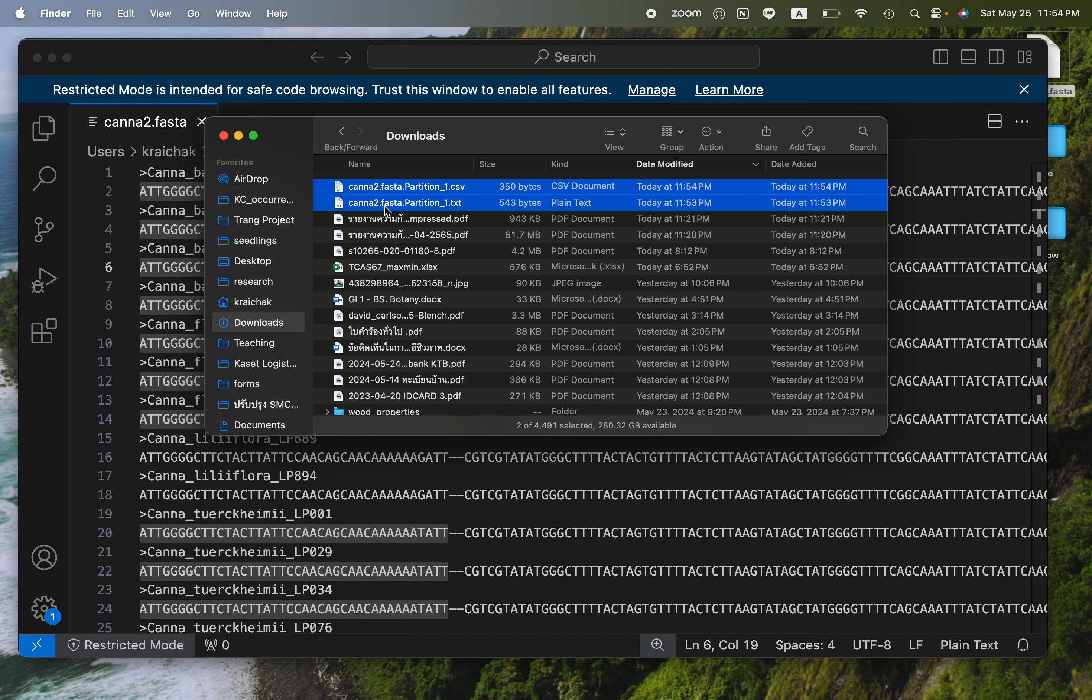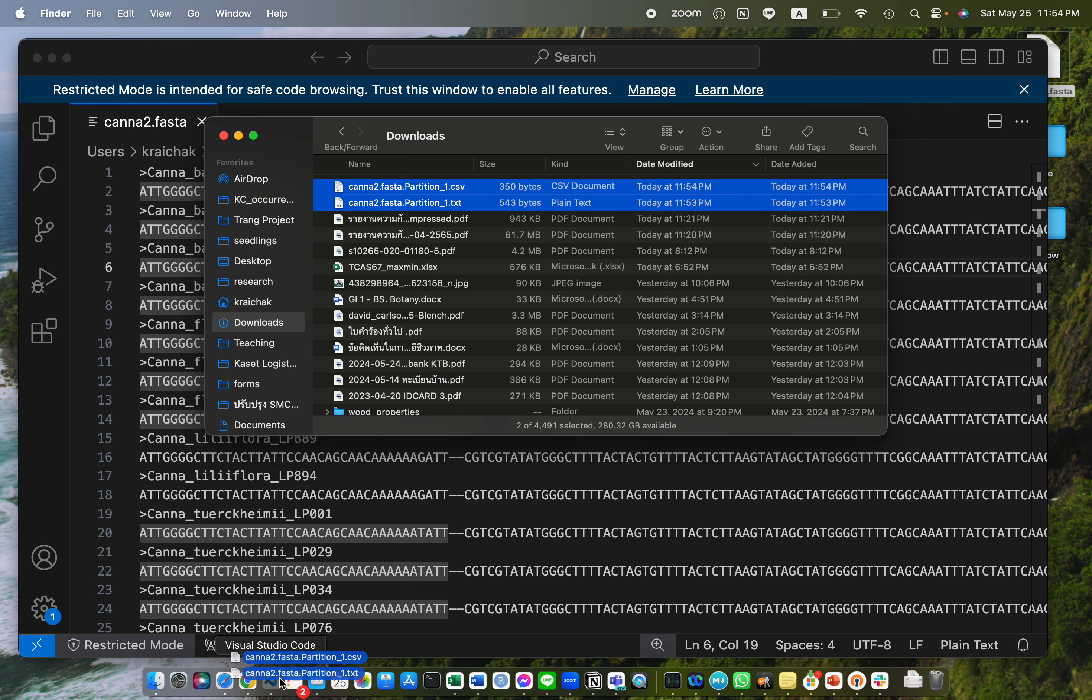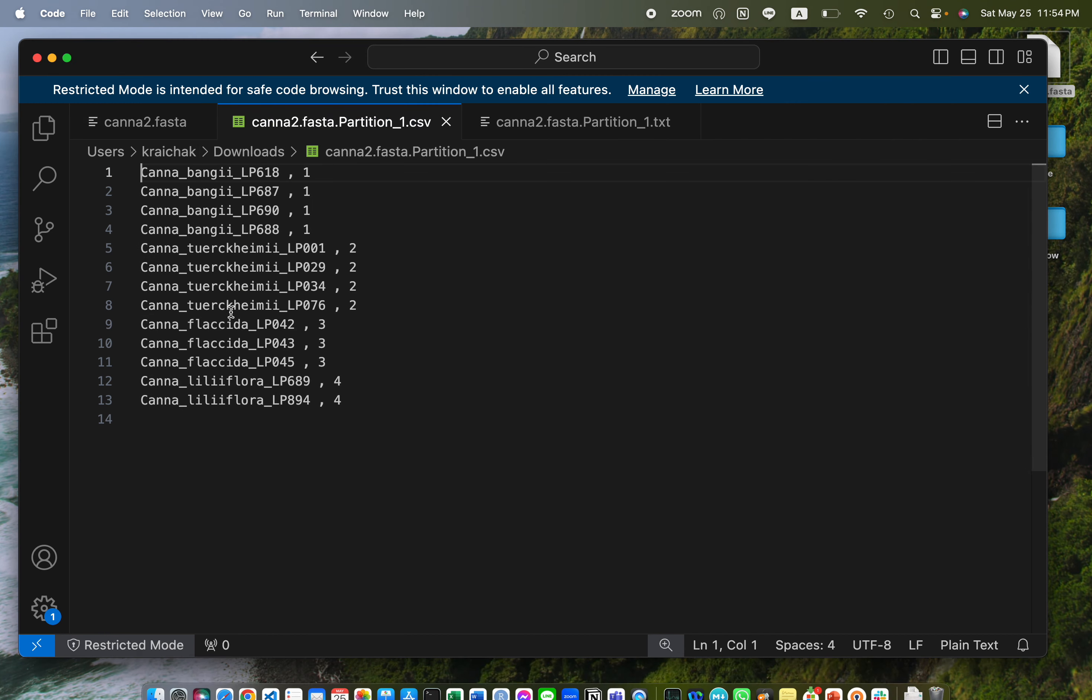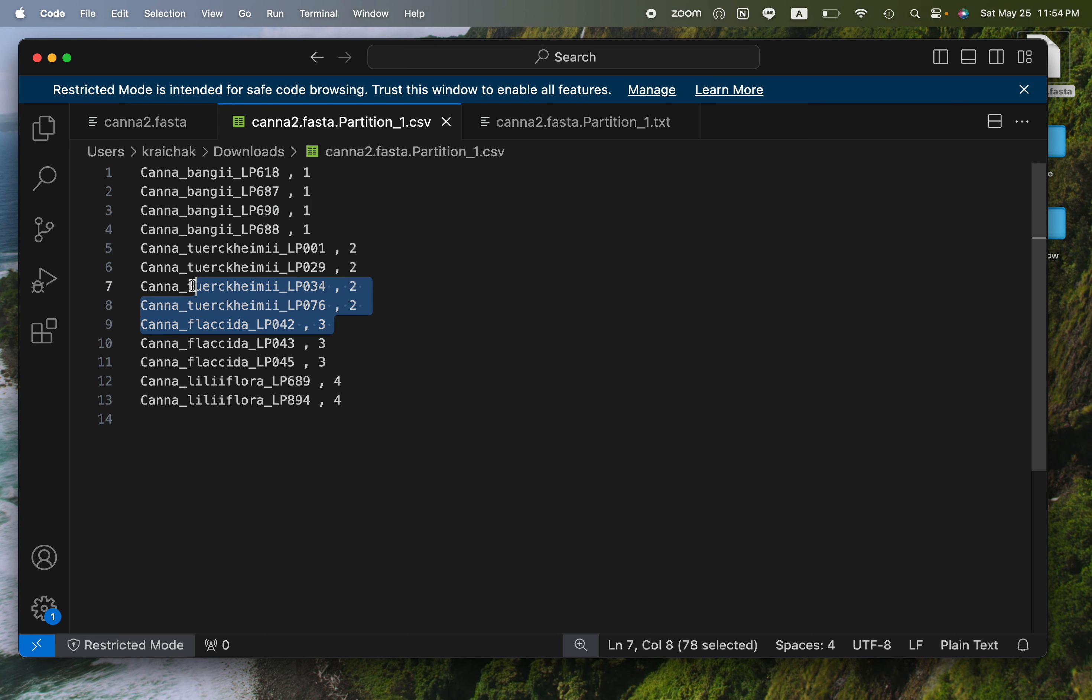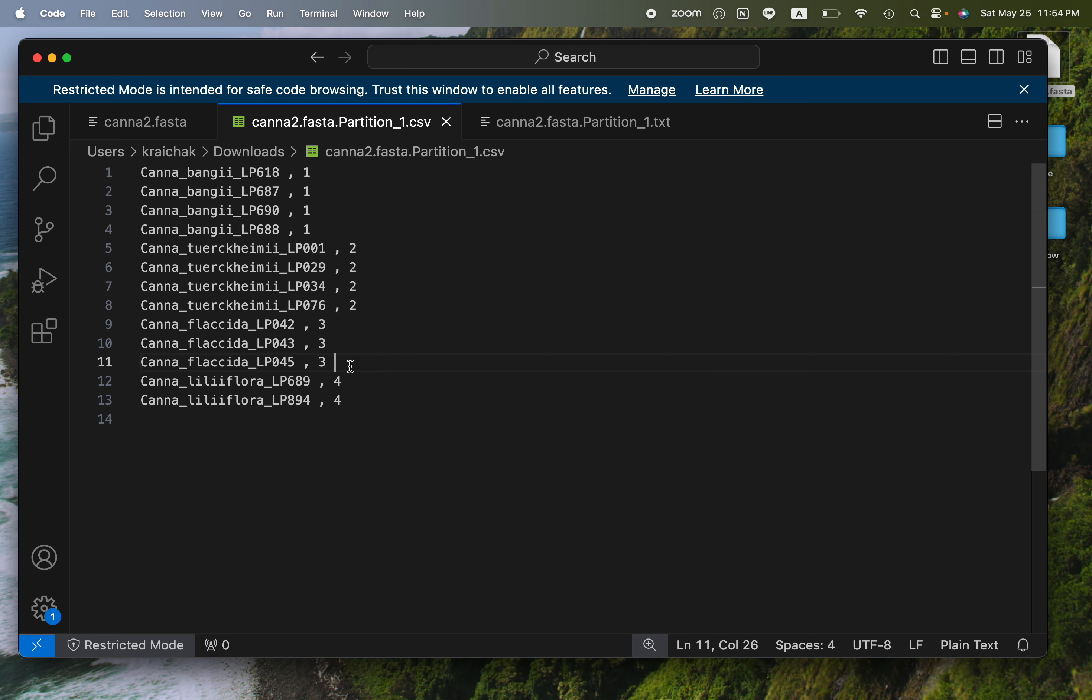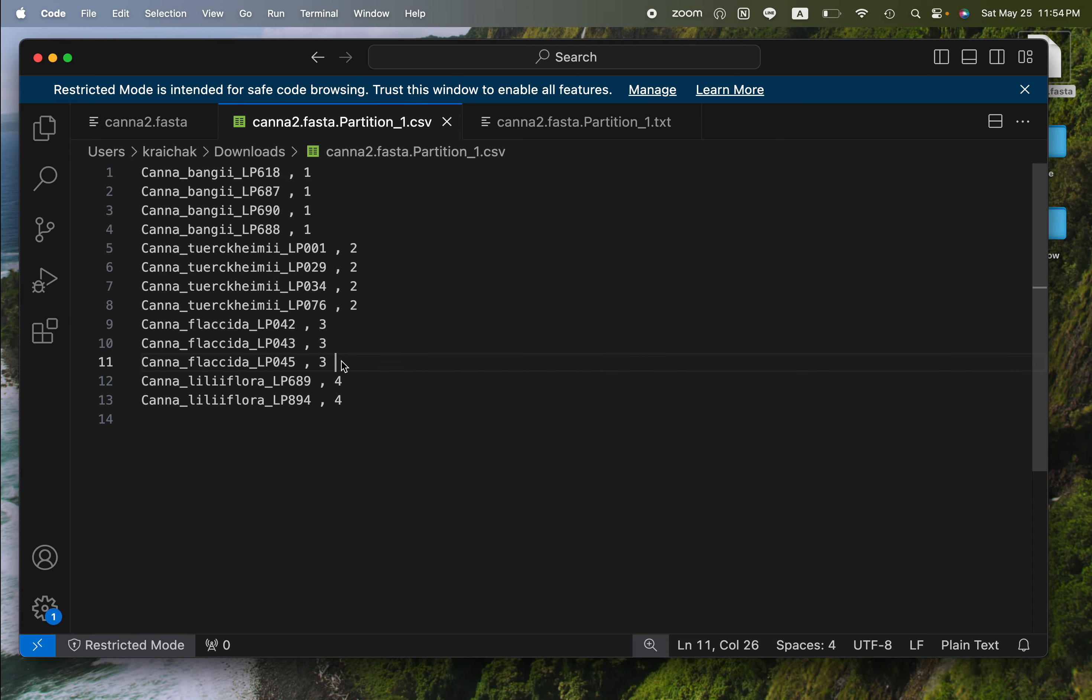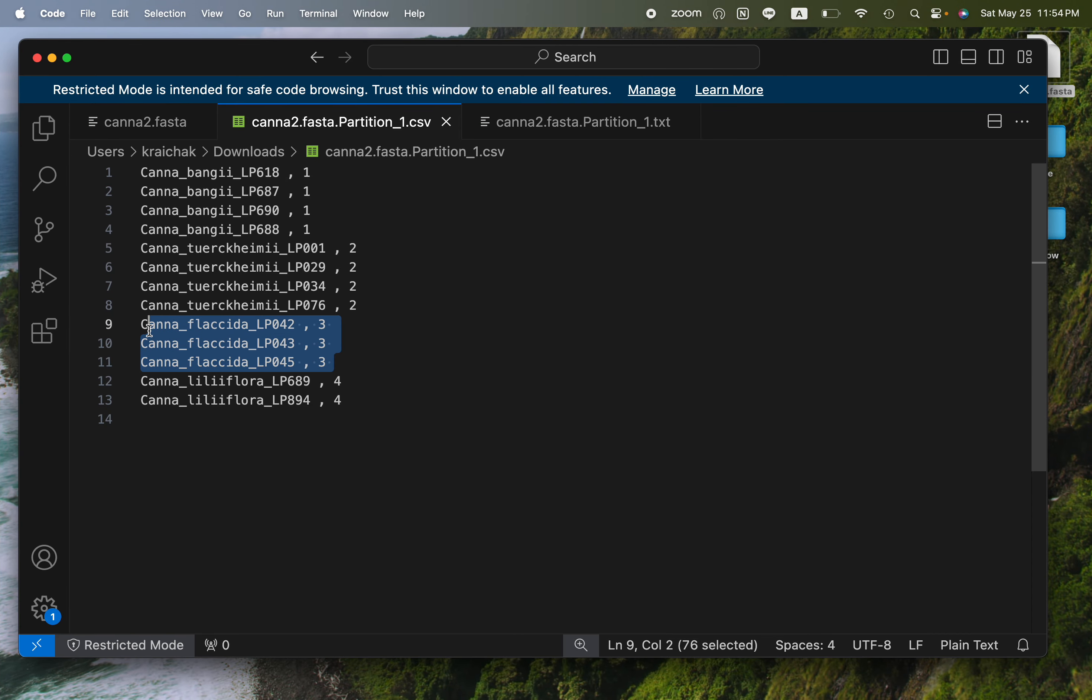You can drag them here to view them. This will show you that all the Bankii here belong to group 1, Takamani belong to group 2, Flacida belong to group 3, and Lillifola belong to group 4. All the other options would group sequences by group here.